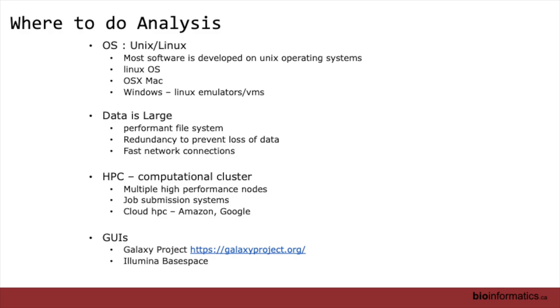So where do we do analysis? Most of the software that's being developed for doing this type of work has been developed on Unix operating systems. We all work with some version of that. Mac has a nice terminal program that's very Unix-like. Linux systems as well. I think Windows also has Linux emulators. PowerShell, I understand, is very Linux-like as well. I'm not sure what computers you're using, but we should be able to do this type of work on all of them. Again, we're going to rely on something called Docker, which I'll explain in a minute.